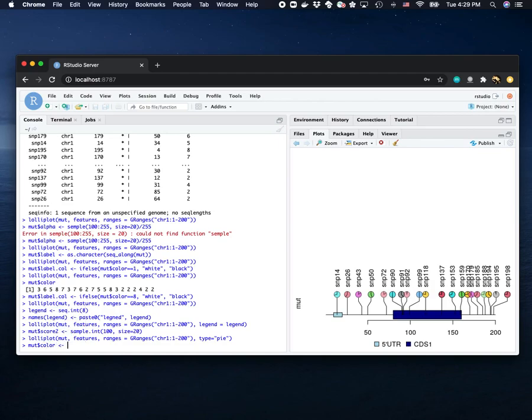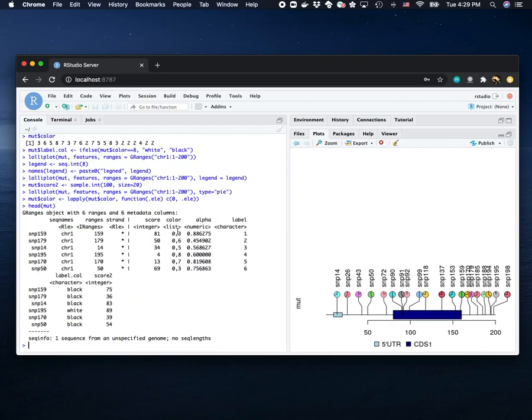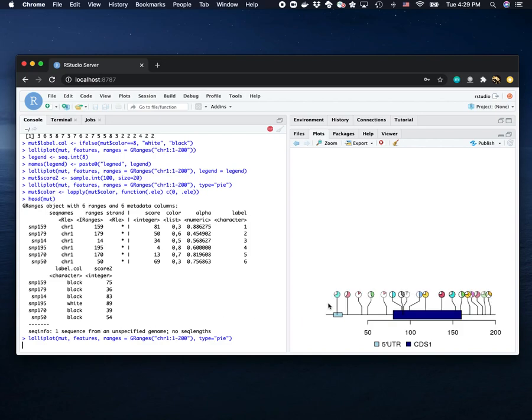We see we already have some color set. We just change it to a different color. We give a 0. We see what we got. We have a list of colors of them. The first is always 0. We can see there is always a white color here.